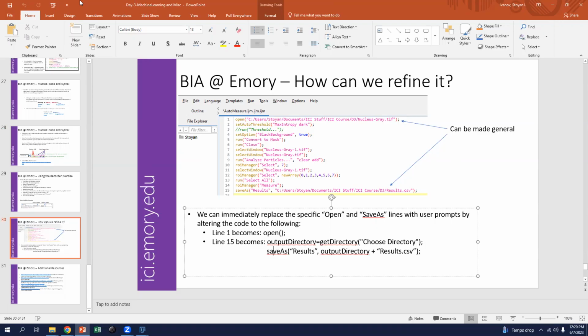But the hard code to call it directly in case you can't figure out how to do that. So what you do is you replace the bioformats.